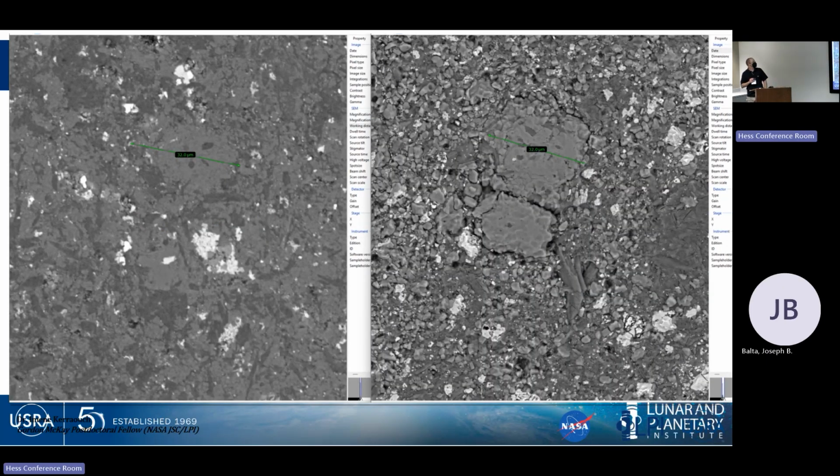These were 2 images done on our electron microscope of these are similar materials, not the same zone. Okay, same materials. They were prepped in 2 different ways. This one was prepped by standard polishing. This one was prepped by ion milling.